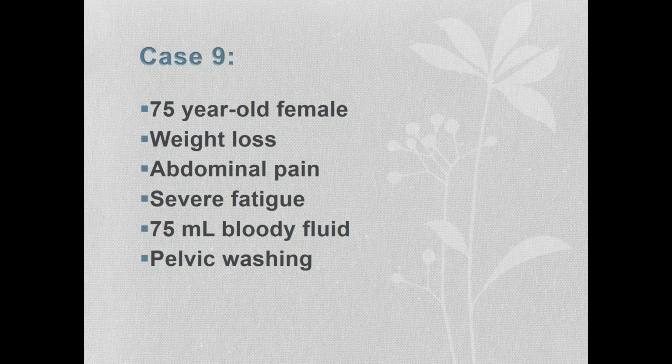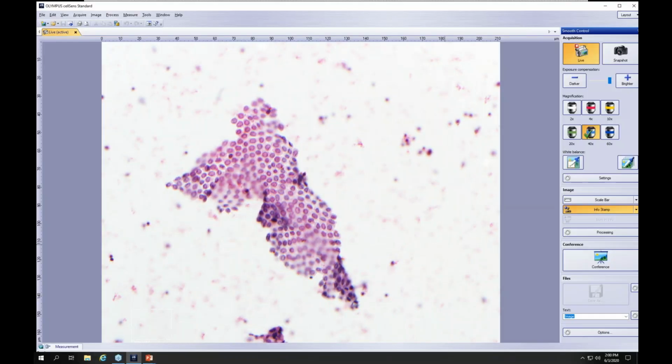This is the Papanicolaou stain. I'm going to show you this because I want to show you that there's beautiful sheets of mesothelial cells. Beautiful sheets of mesothelial cells that you can see here in the background.